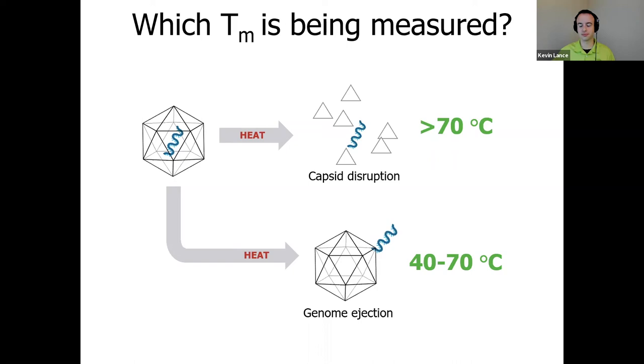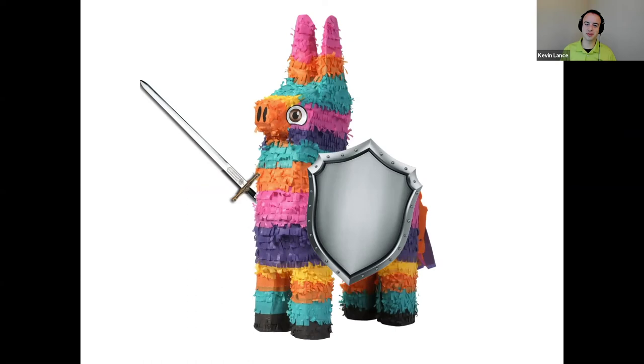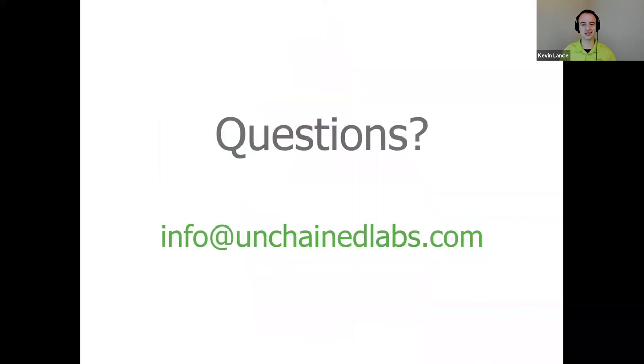And so now with all of this Uncle data, you can help to create an AAV that's ready for battle, not afraid of that broadsword wielding Viking, and that AAV is not going to fall apart when under stress. And with that, I think I'll stop and we'll take any questions we have.